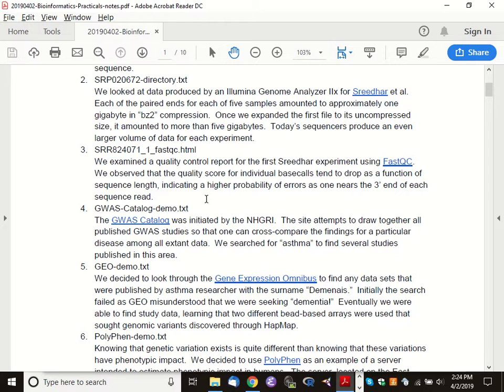Right. So I did not include what the FASTQ looks like, but in one of the earlier lectures, you would have seen an example of this. Essentially, these are blocks of 4 lines at a time, and one of the key lines is the sequencing read itself. What letters did we observe on this particular read? And also a line of characters that represent the quality scores for each base call. So Phred is very much in operation, even though they're not using the code base from the University of Washington. The way that they compute Phred scores may change depending on the sequencer type, but their goal is still to say, what is the probability of error for this individual base call?